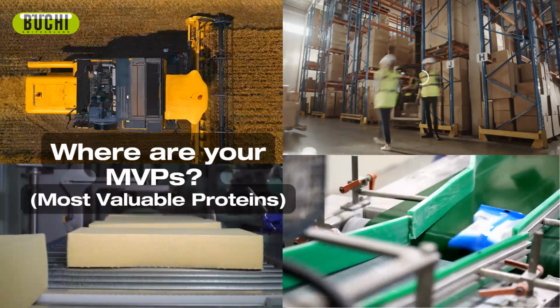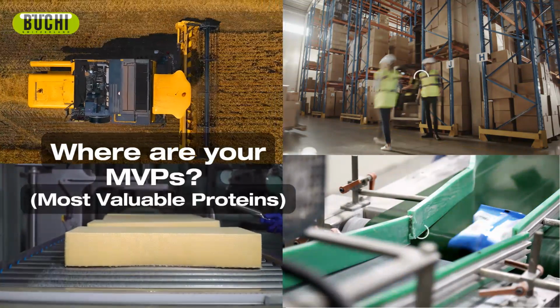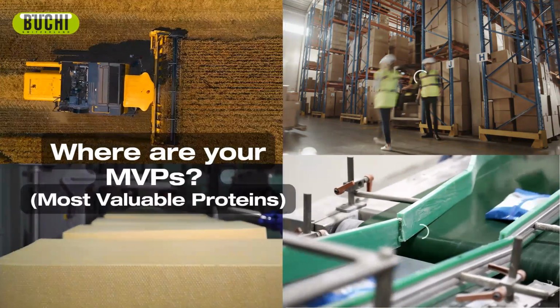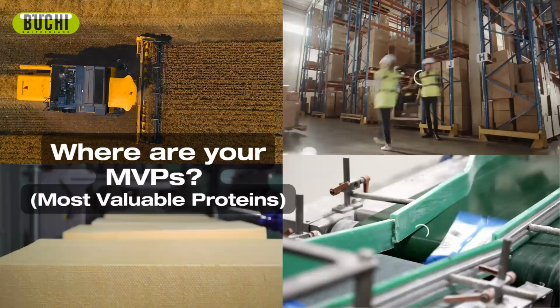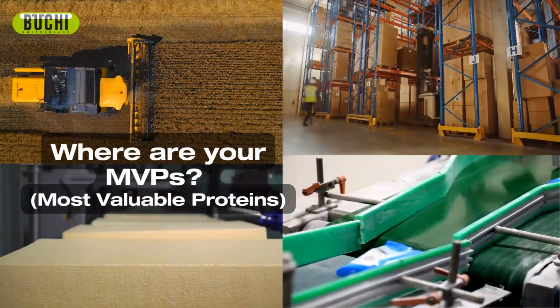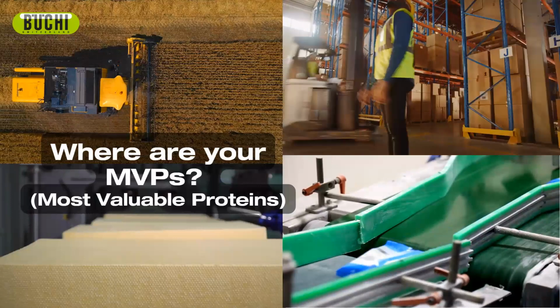We know protein is an expensive resource in food and feed products. And so one of those important questions to ask is where the most valuable protein measurements are. So Ryan, can you go ahead and give us your thoughts on this one?